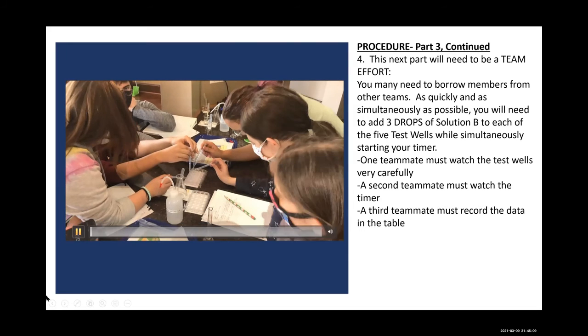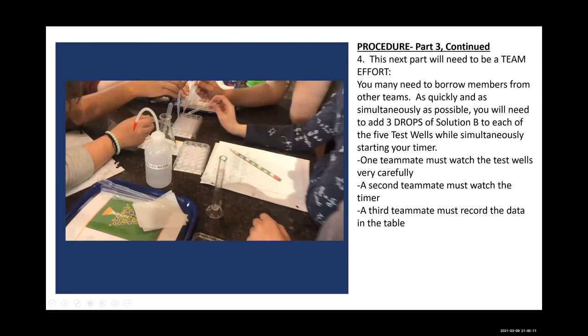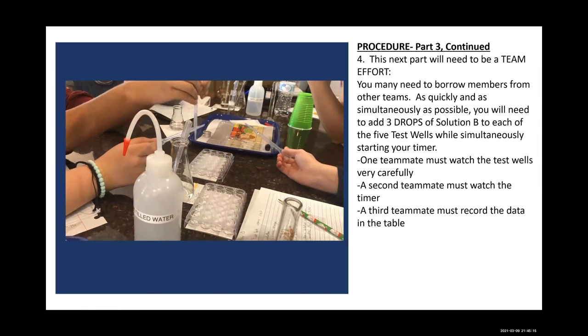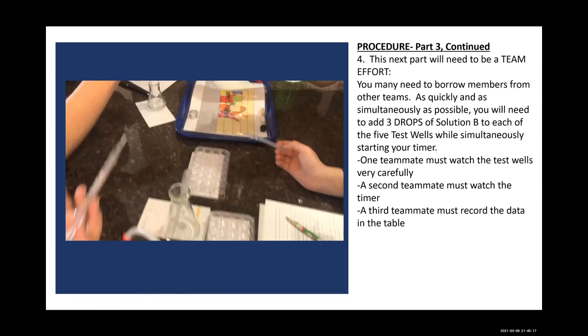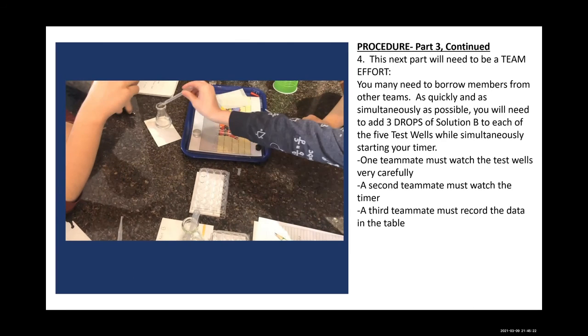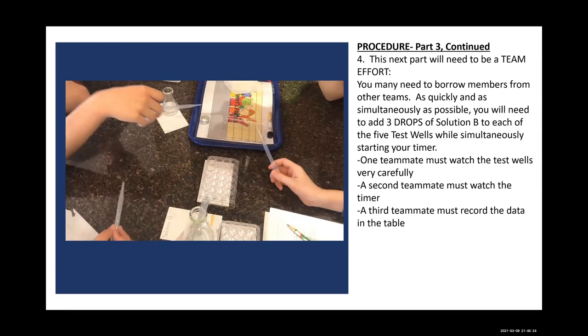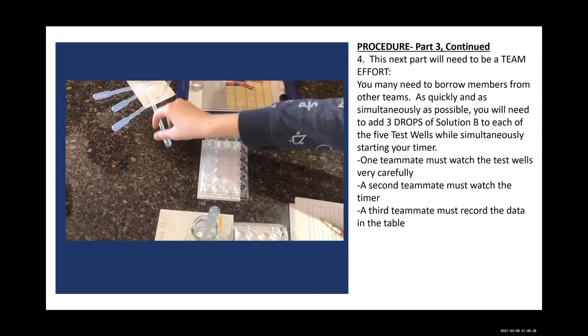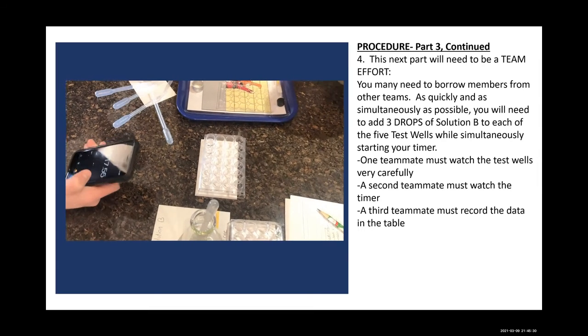2 and then 3. This one, that was going 0, 1, 2, 3 for that one. Cool. I'm so sorry, guys. Okay. It's fine. Nothing's happened yet. Yeah, make sure Cole can see because he has the timer. 37. Don't pause it, Cole. Just tell me what it is when it happens. Keep them all right here. Middle one was actually the last one. 15 seconds.